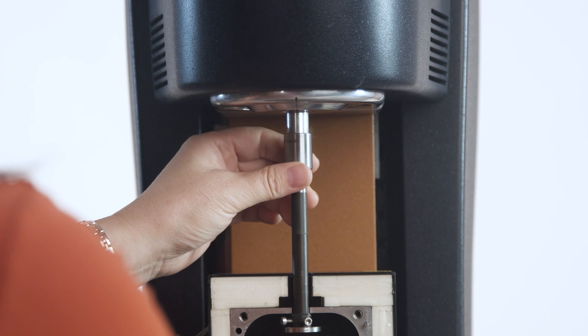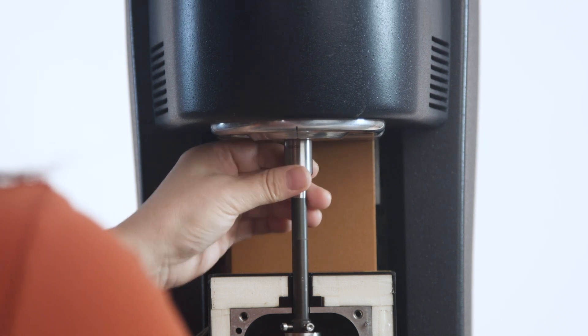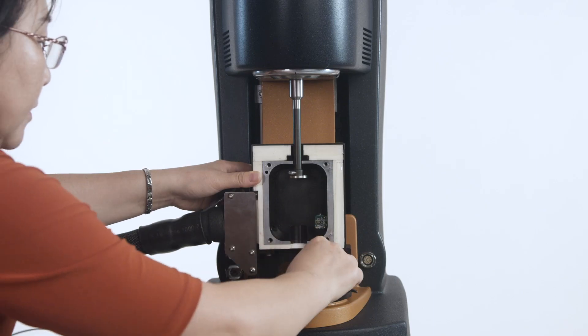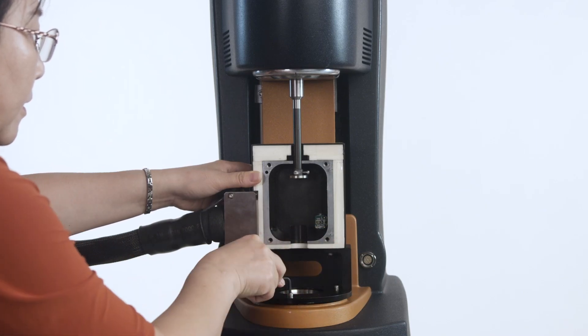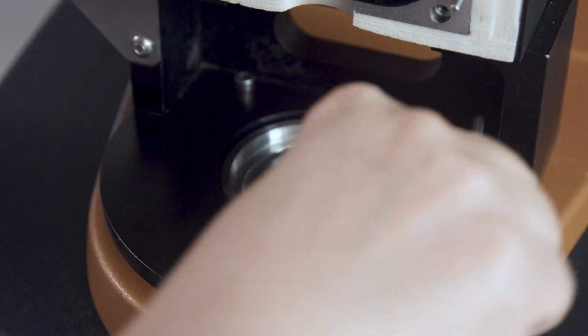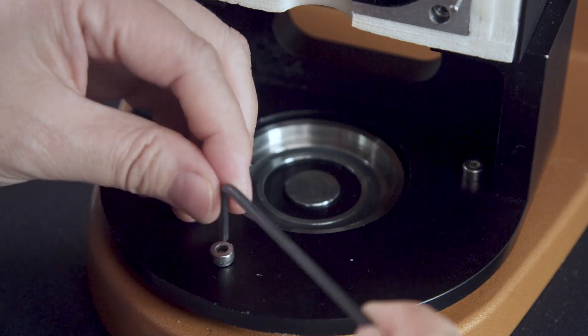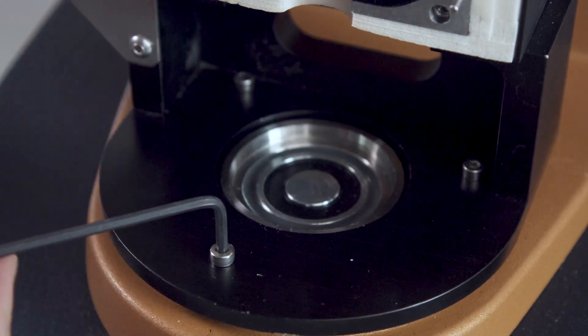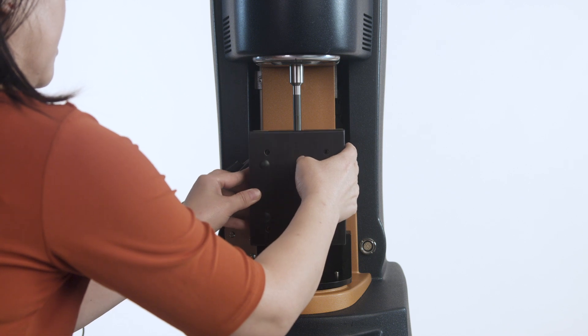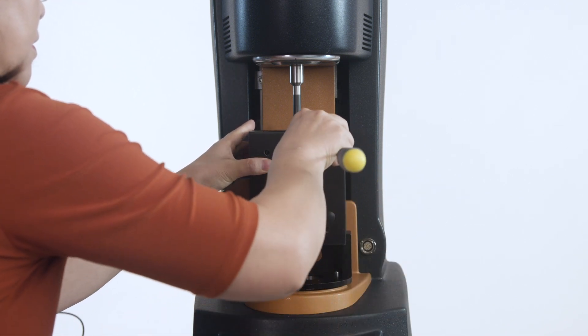Attach an upper geometry to the motor shaft using the draw rod. Use this upper geometry as an alignment tool to adjust the base of the sample chamber so that there is an even gap around the upper geometry shaft. Tighten the mounting screws. Fit the front half of the sample chamber and make sure the gap around the upper geometry shaft is still even.